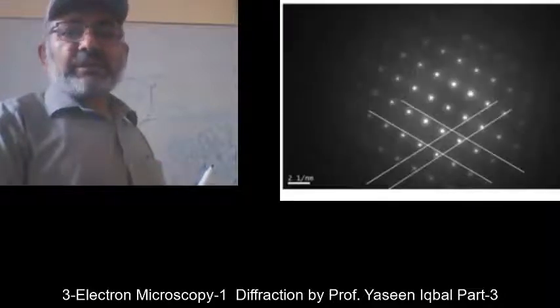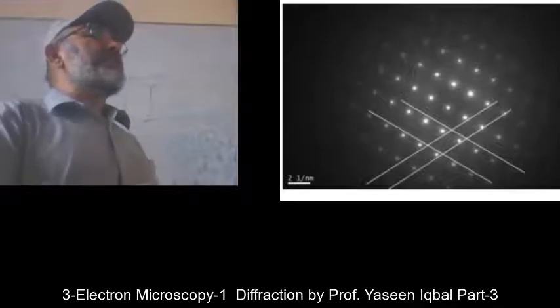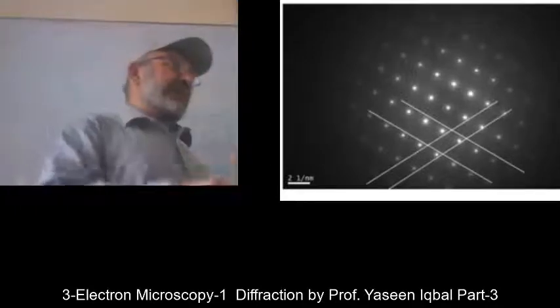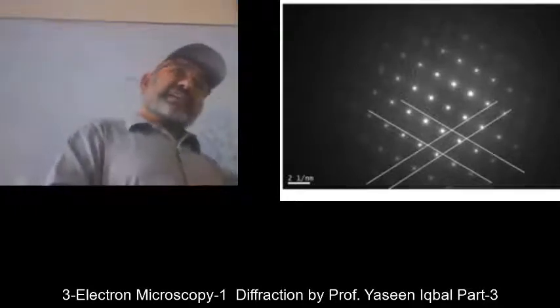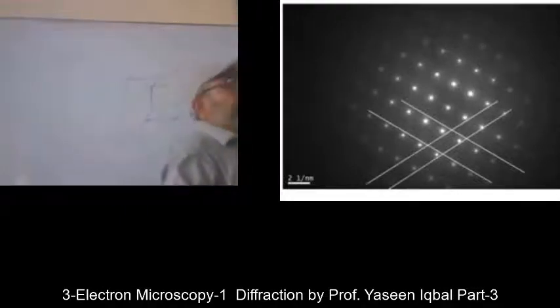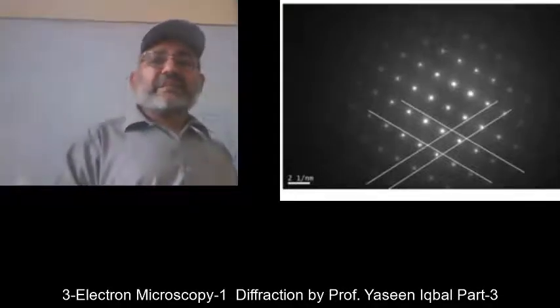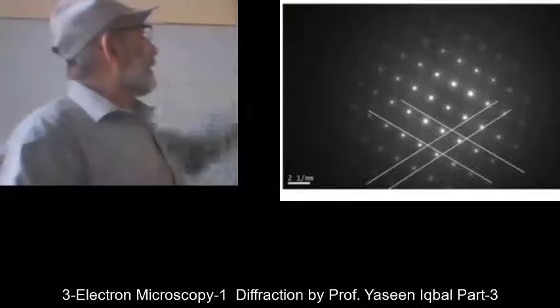This was the case when we had no specific calibration or mark from the inside of the machine. Nowadays, we get this thing to 1/nanometer. This label, this mark, this sign on the diffraction pattern. So when you see this sign on the diffraction pattern, it makes your job easier.